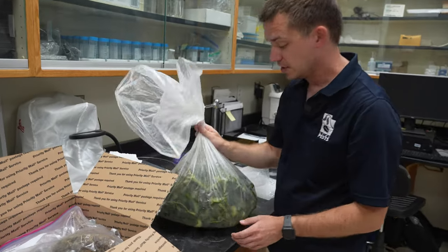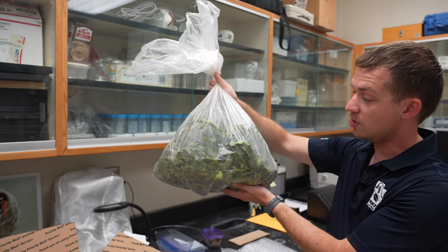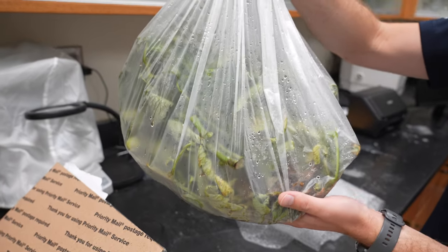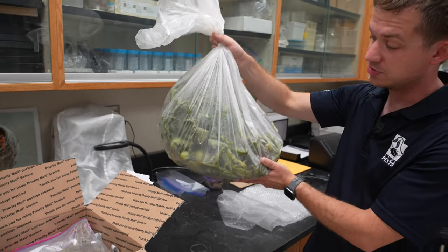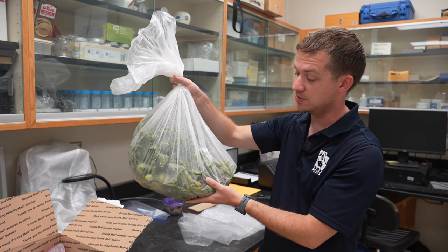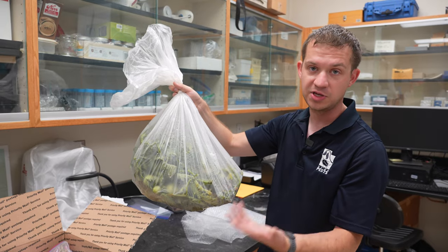If a plant is very large and you can't fit it inside Ziploc bags, trash bags or another large bag is okay. You just want to make sure there's not excess moisture in the bag. We can see some moisture that has built up here — that is okay and expected for a very large sample. However, you would want to make sure this is shipped overnight to the diagnostic lab, as sitting in the mail for long periods of time can damage the sample to the point where it gets moldy or rotten and we can no longer test it.